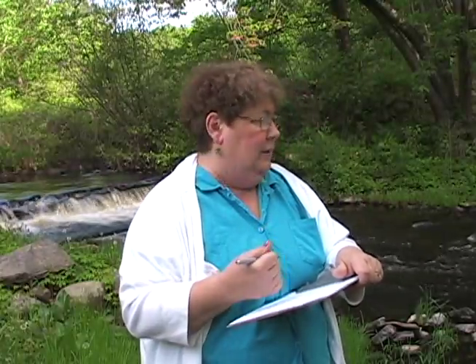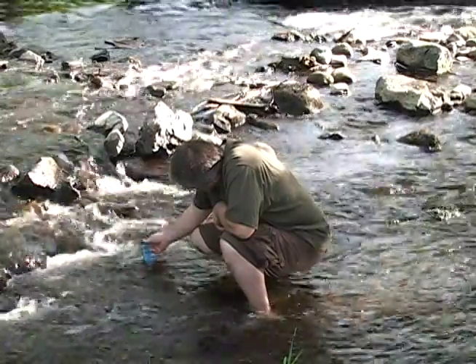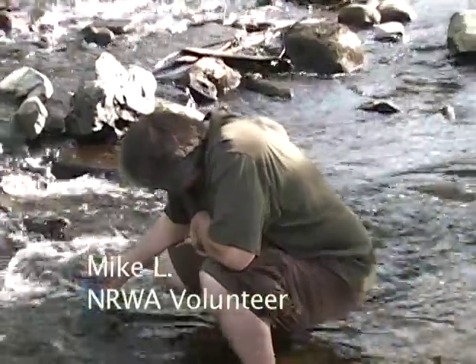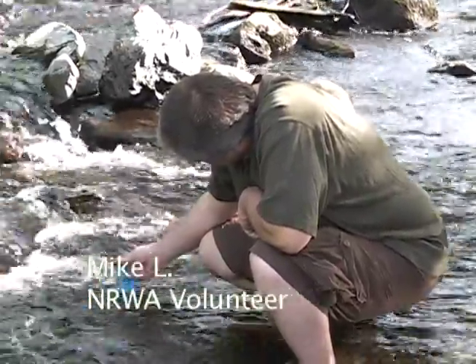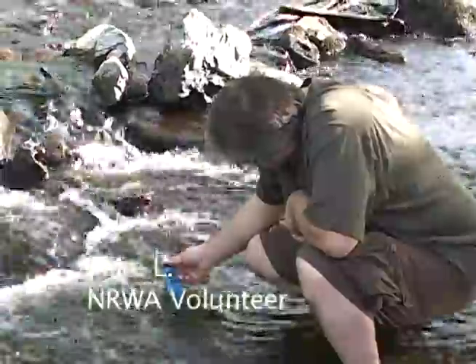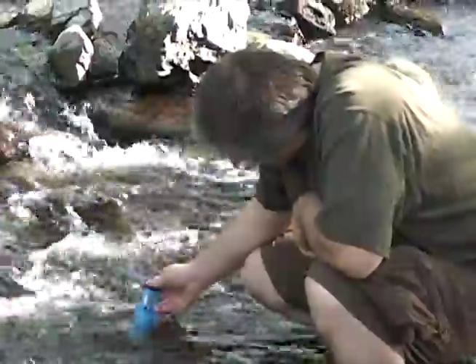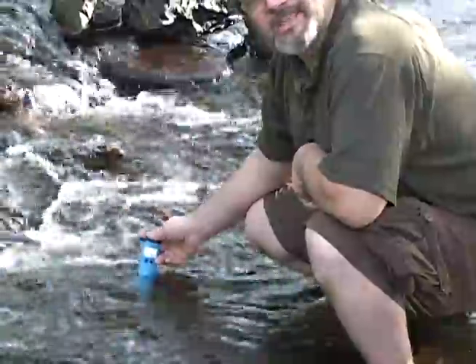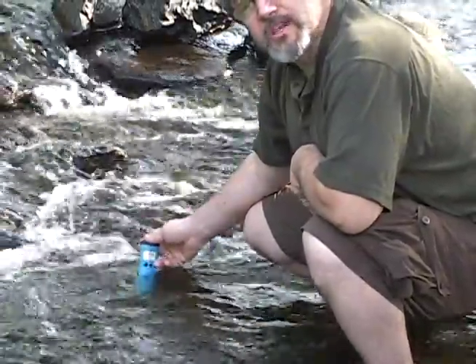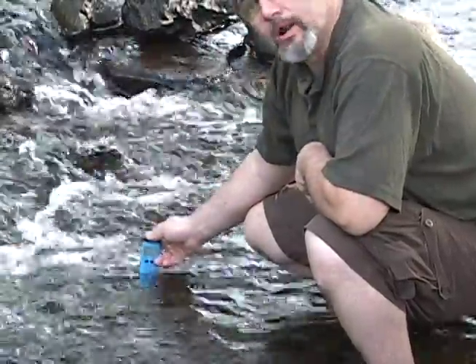Water temperature we're going to get in a few minutes. We're doing conductivity and temperature simultaneously with the special instrument, which takes a few seconds to even out. And one of the things is that you really need to be in the water safely. Temperature is 16.5 degrees centigrade. And 194 for the conductivity.